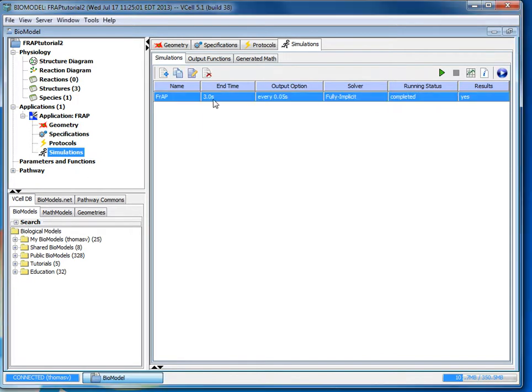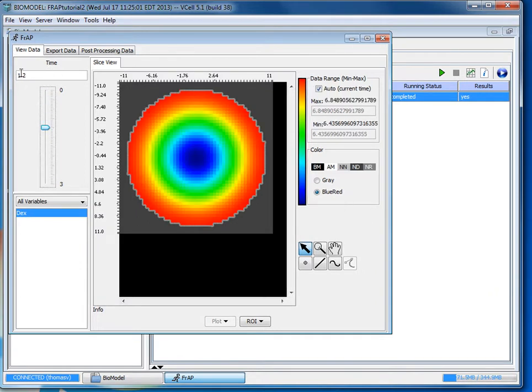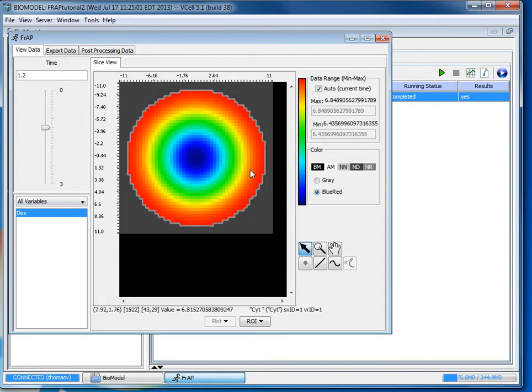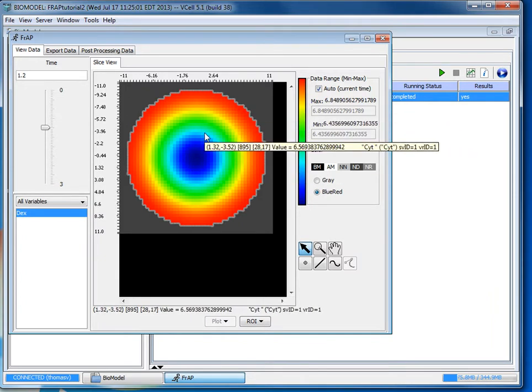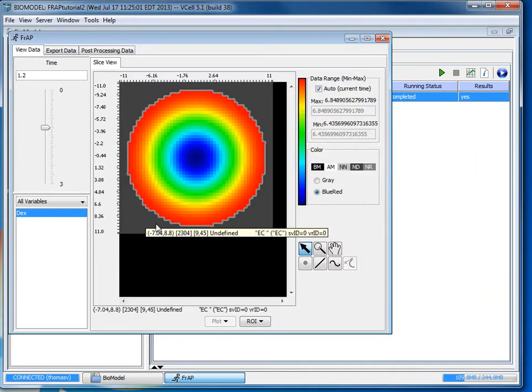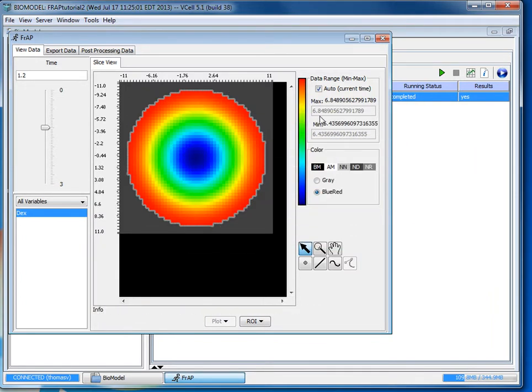Now you can select the simulation and click on view simulation results. Where it says time you can change the time from the output intervals and see how the concentration of dex has changed within the cell.